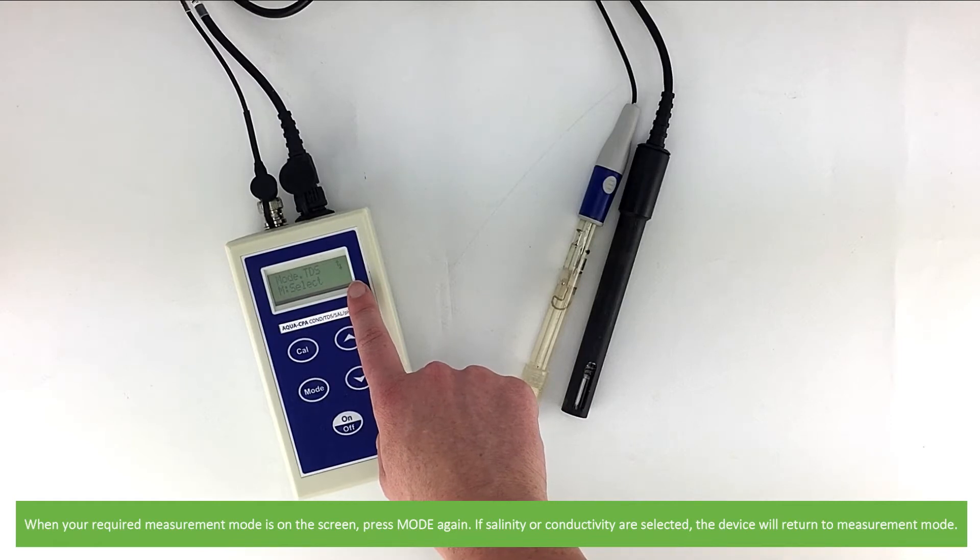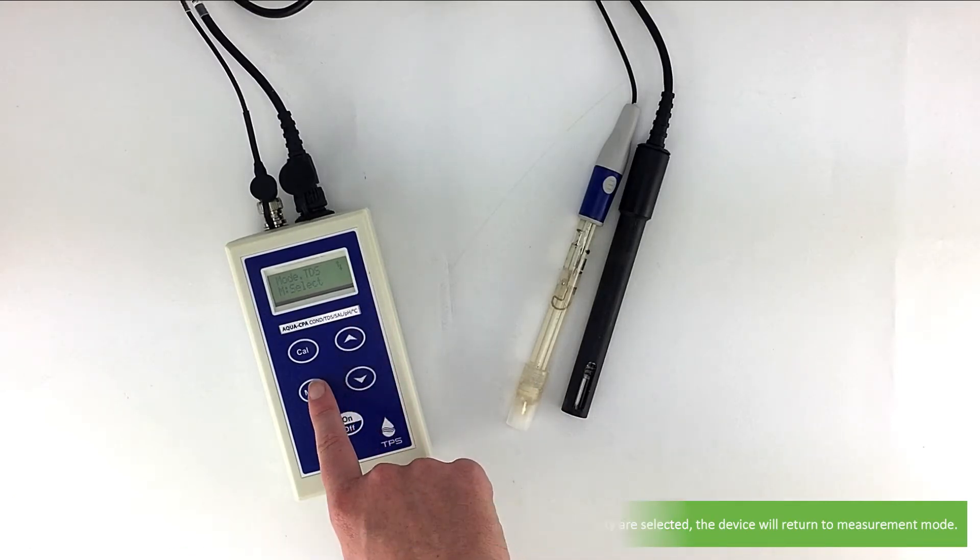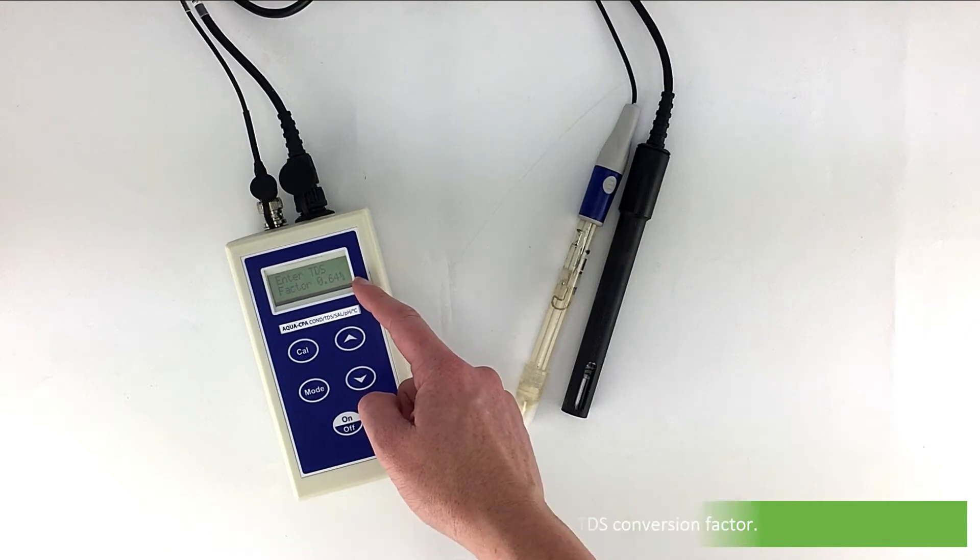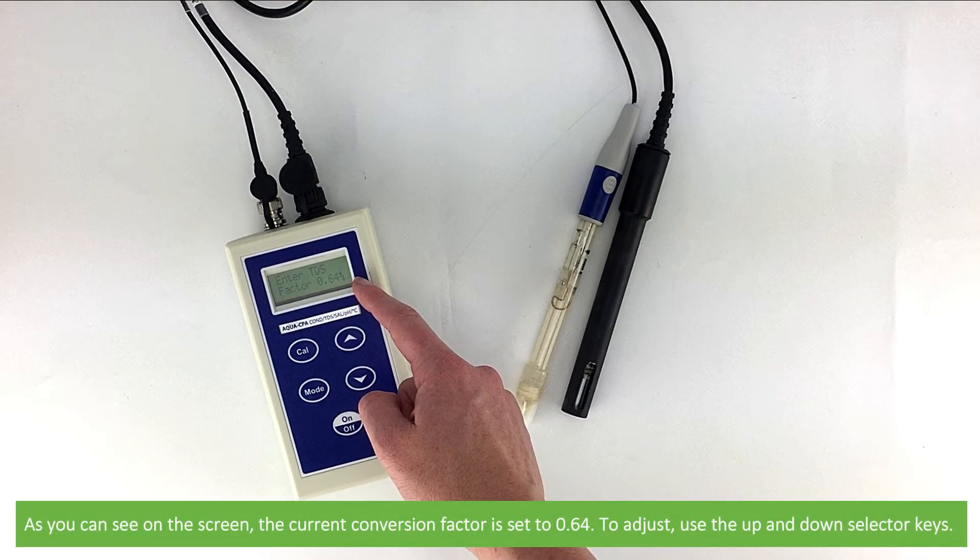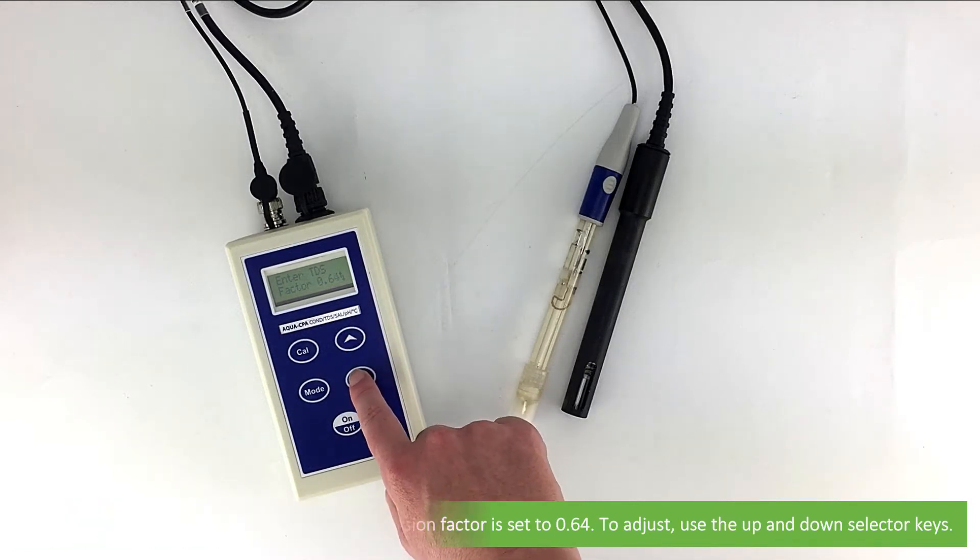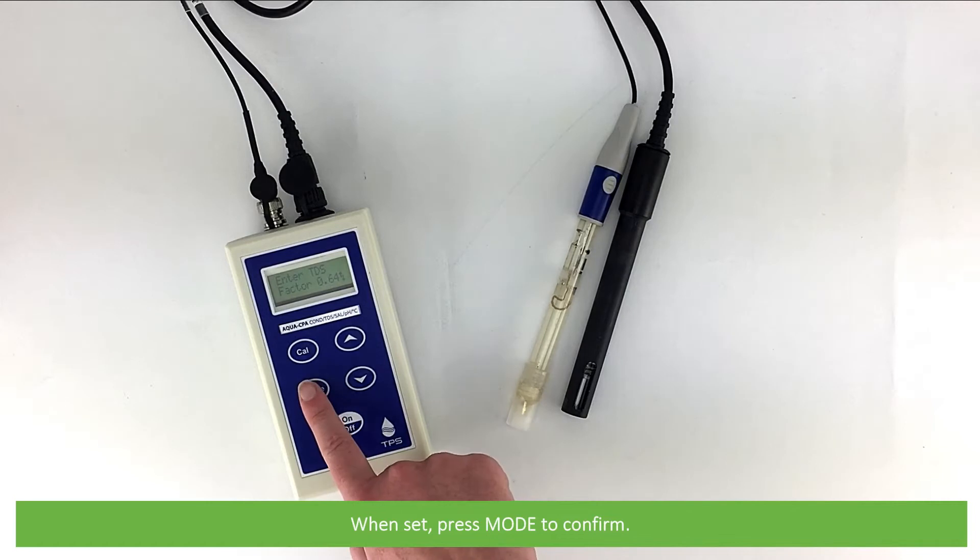If salinity or conductivity is selected, the device will return to measurement mode. If TDS is selected, you will need to choose the TDS conversion factor. As you can see on the screen, the current conversion factor is set to 0.64. To adjust, use the up and down selector keys. When set, press mode to confirm.